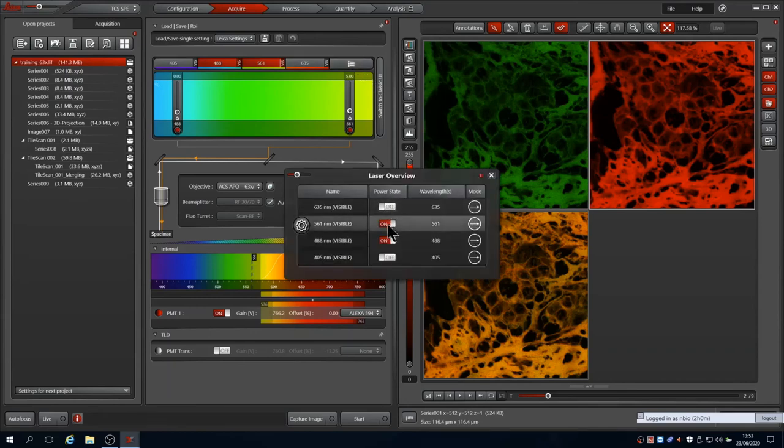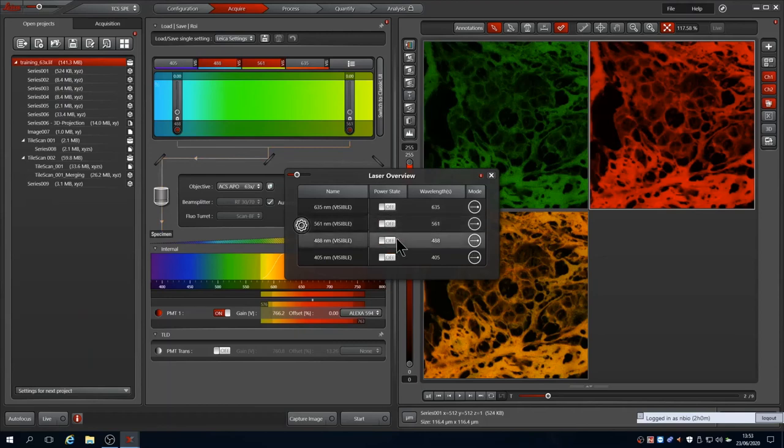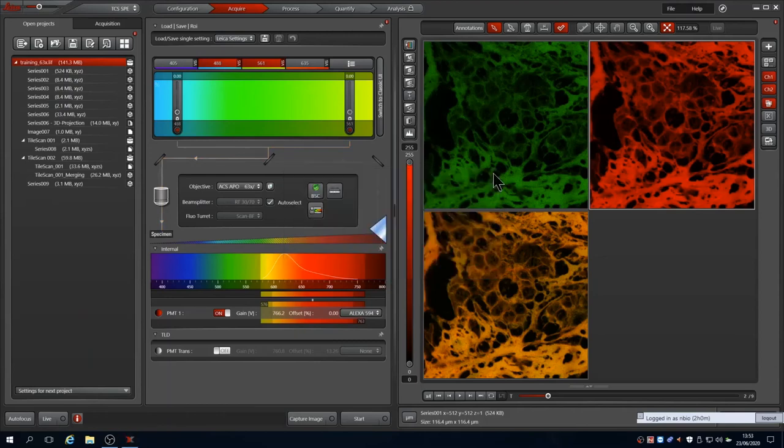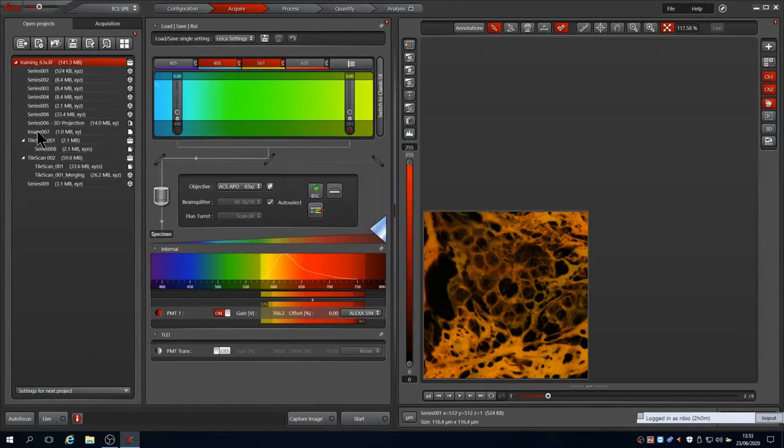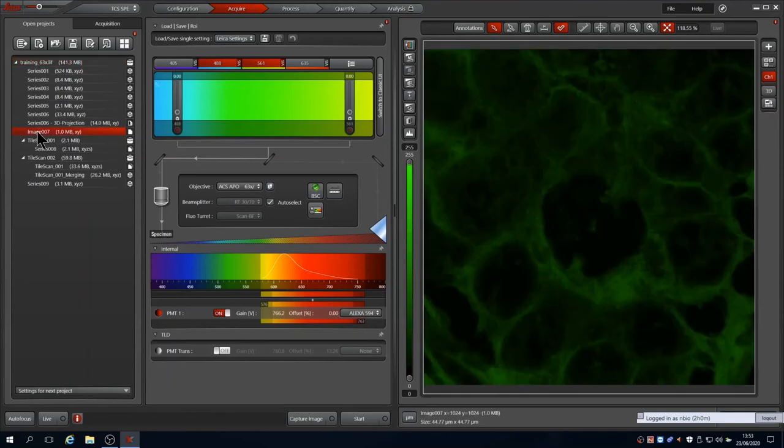Once all data are saved, as shown at the bottom of LASX, open the laser panel and switch off all lasers used. The next time you come to image, remember that you can open the previous lift file, choose one of your images and reuse the settings via the Apply button.